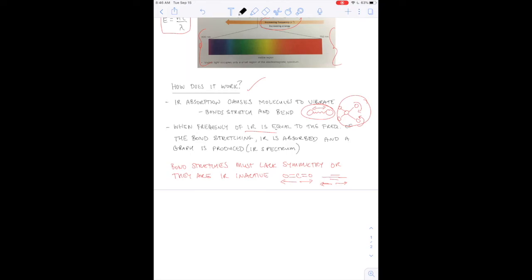All right, so a couple more things and then we'll get to the cool images. If we're referring to frequency, oftentimes we'll refer to frequency in hertz. But if we were going to use that for infrared spectroscopy, we would have to report in this range, which is kind of ridiculous, right?